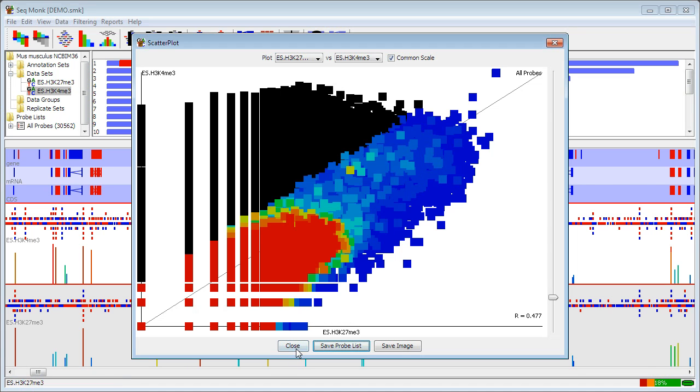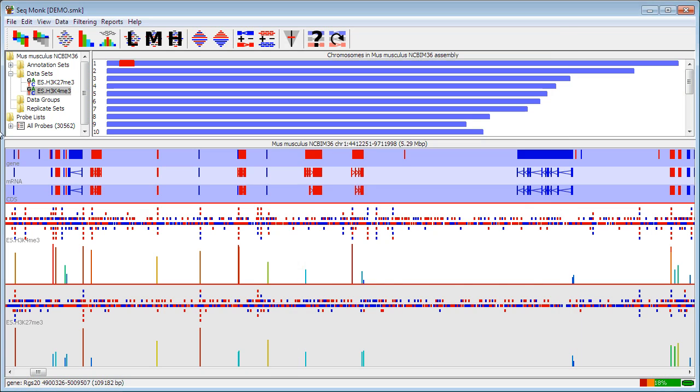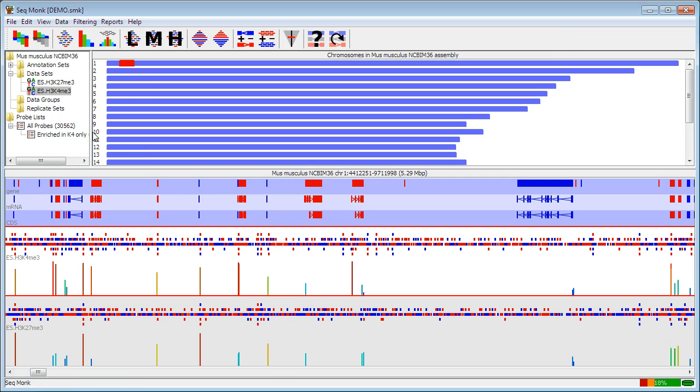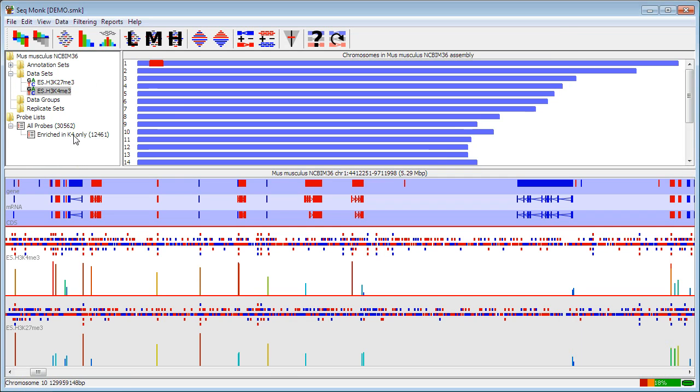And that will then appear in my set of probe lists down here. So the scatter plot can be useful for looking at the comparison of two sets very quickly. It's an easy way to see how consistent they are.